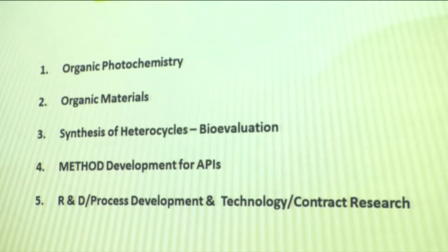The trick I played here is, I used to send the pharmacy student to nearby industries in Hyderabad. The student would go into the formulation unit, pick up the drug or pharmaceutical they are formulating, and come back with a gram of that material. Then we start working on HPLC, develop the method, validate it, and look at the stability studies, all kinds of things.